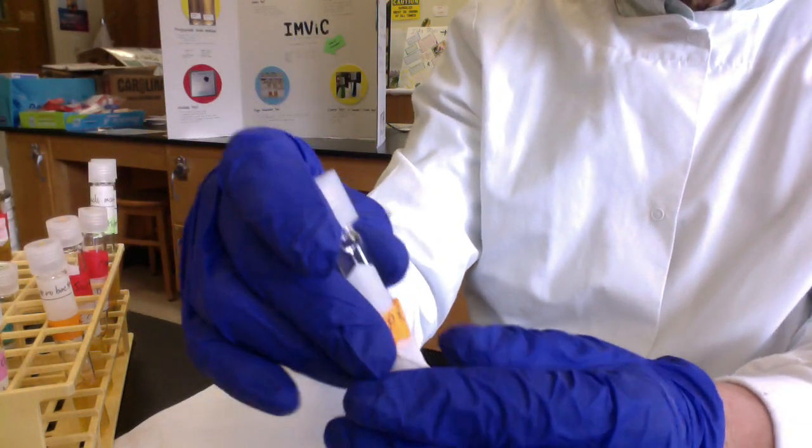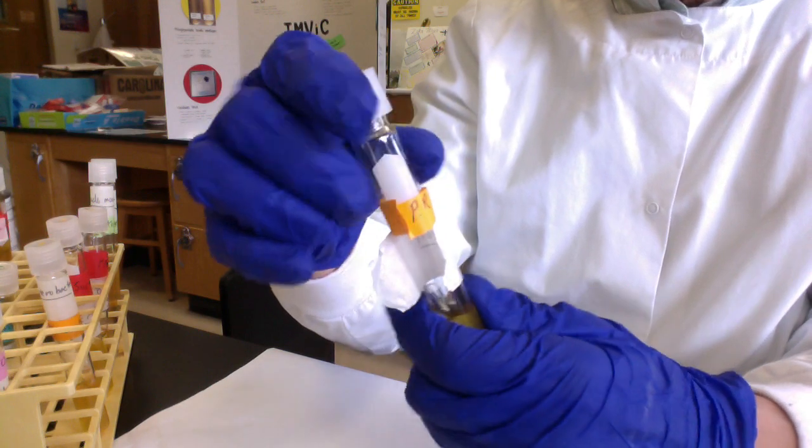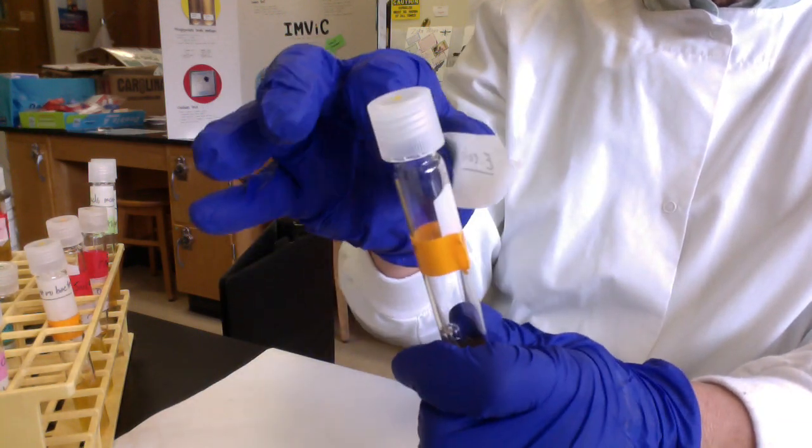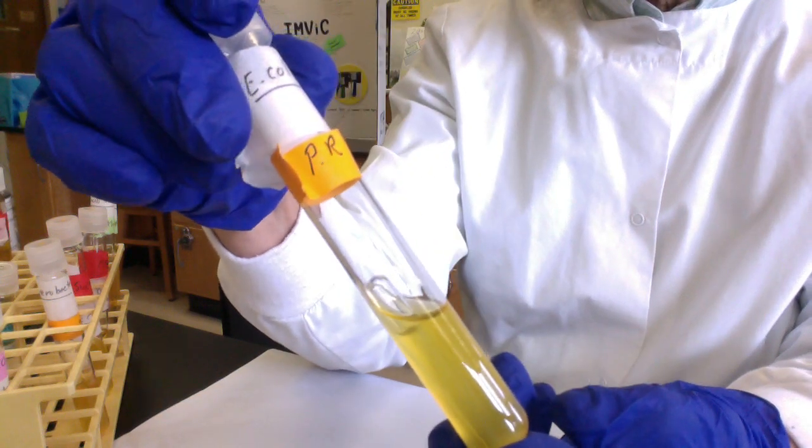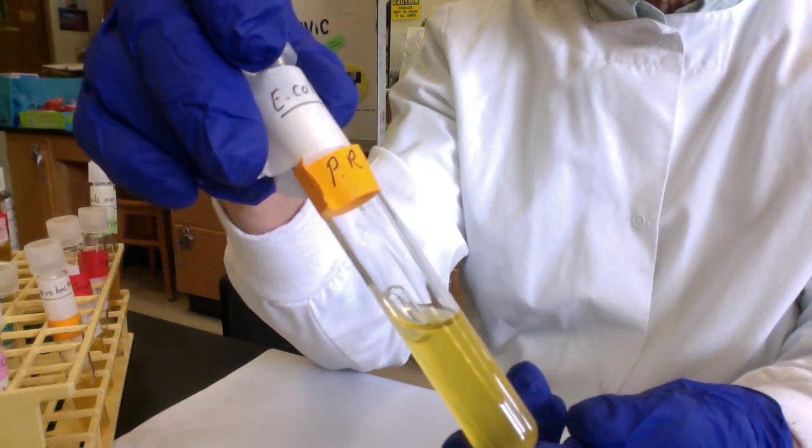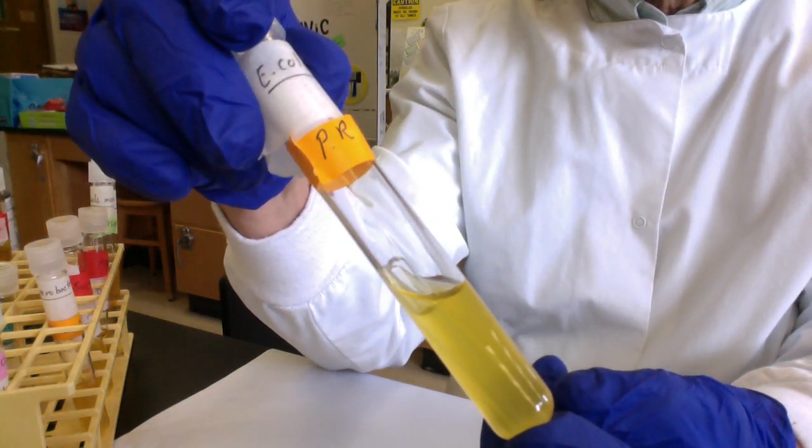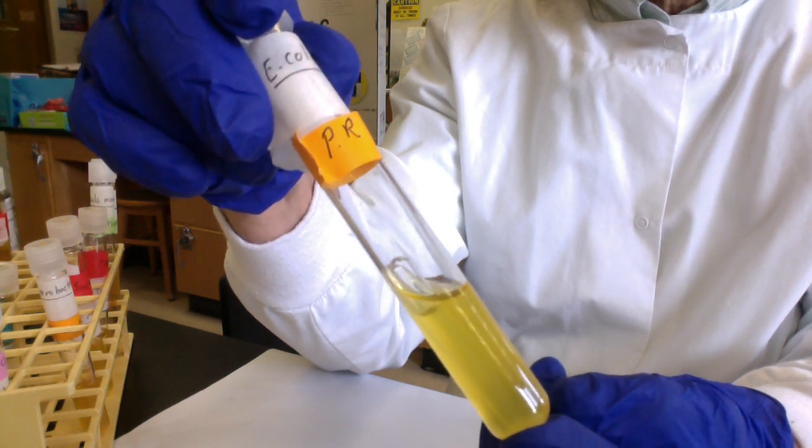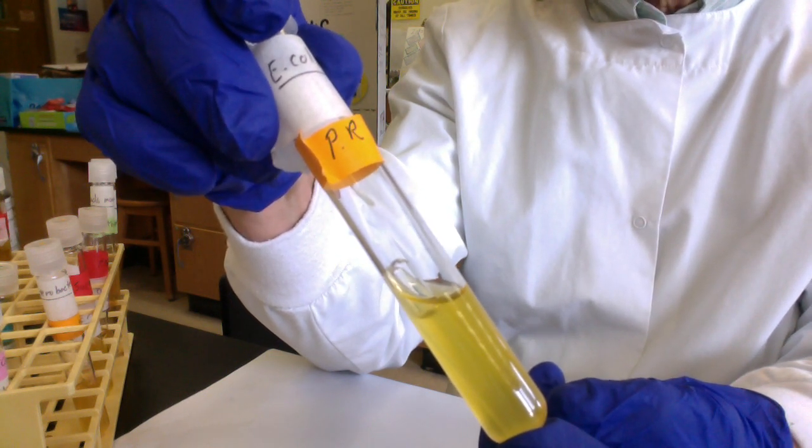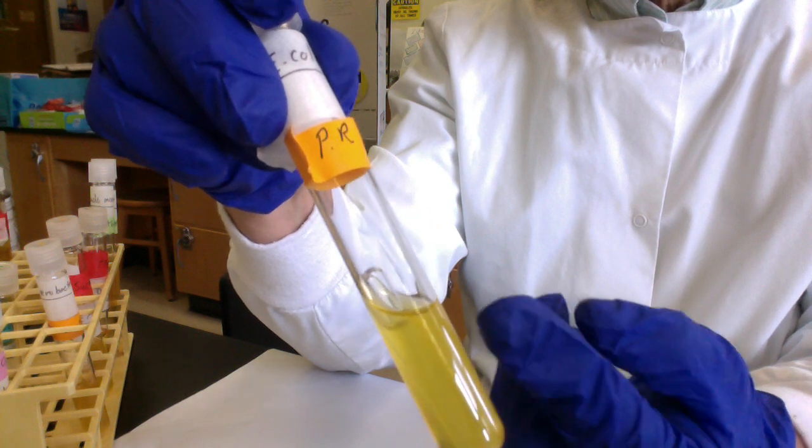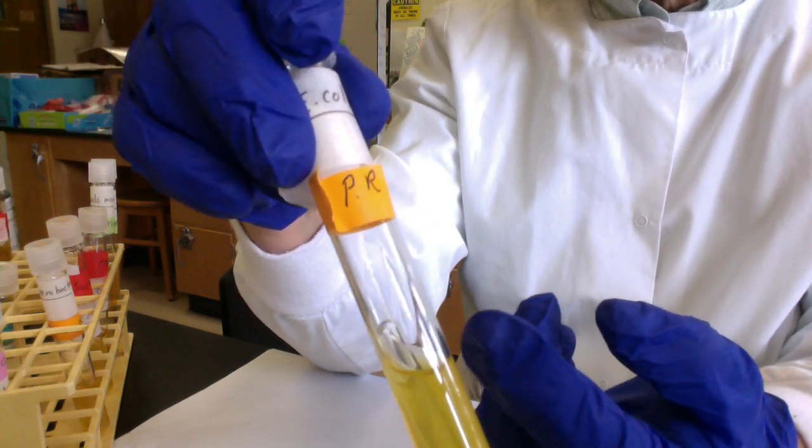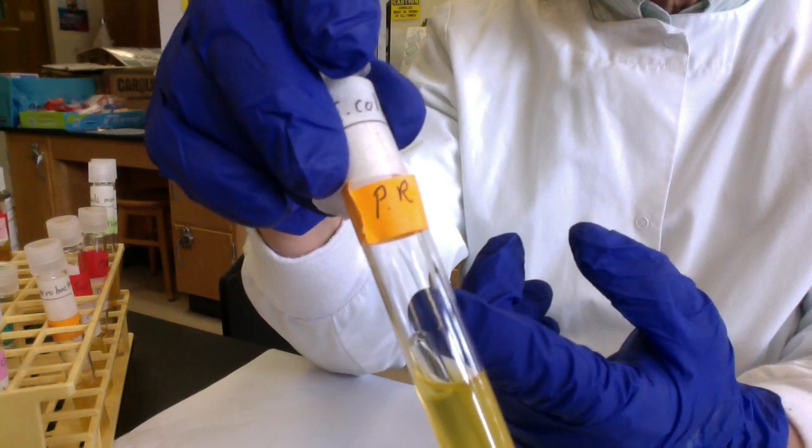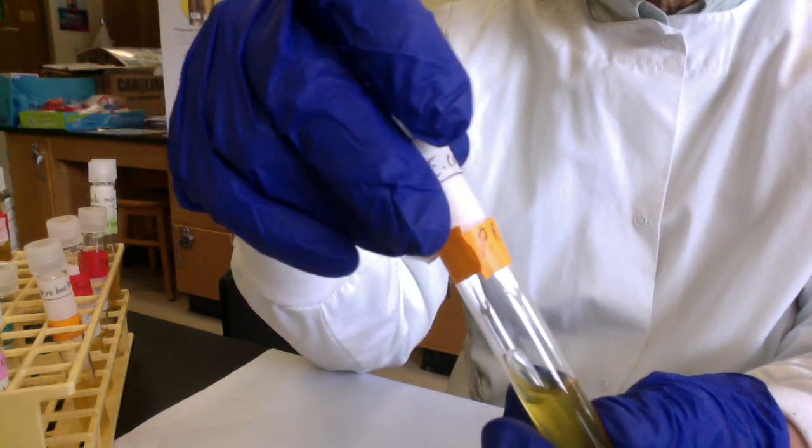This is PR lactose with E. coli. We can see that E. coli must make beta-galactosidase because it fermented lactose. To ferment lactose, you have to make beta-galactosidase. The results are the same as for glucose: A/+ for acid and gas produced during fermentation.